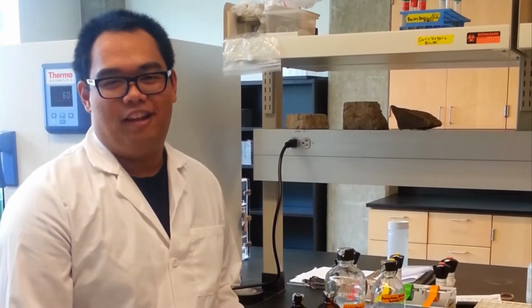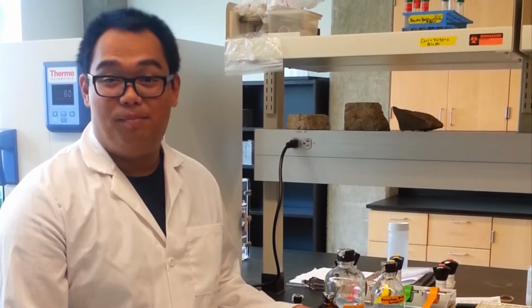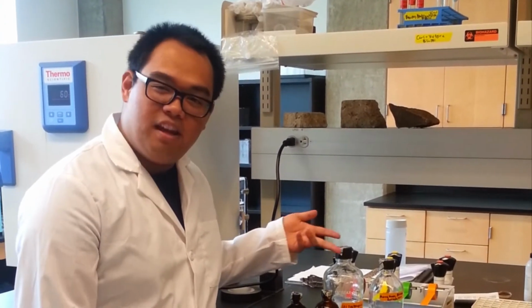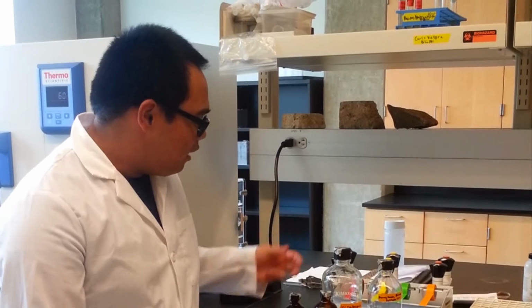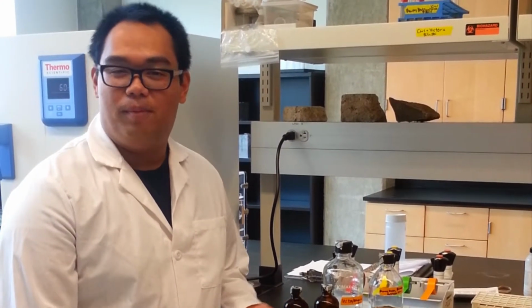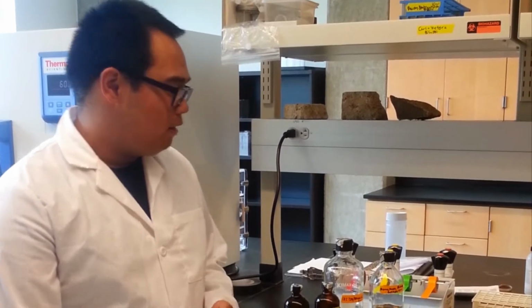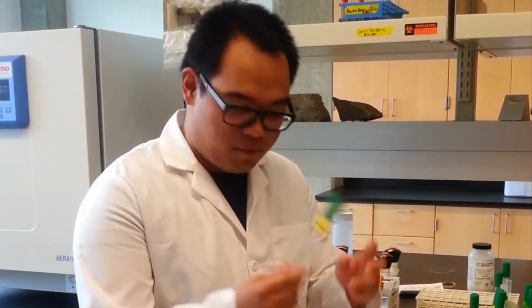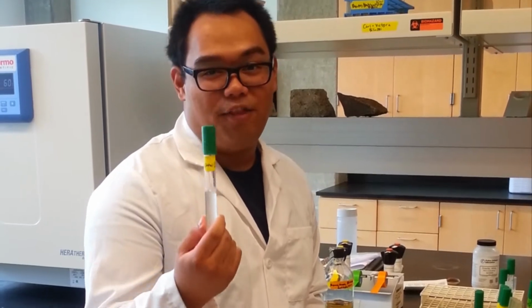So this is the ecology lab. The micro prep room is usually really busy, so I like to work up here as well. This is where we keep some of the media we use to grow our bacteria. Also where I keep the 2 concentrations of salicylic acid, which I expose the bacteria to as well. Just for a demonstration, this is what the tubes start out with, so it's really clear. But after about 24 hours or so, they end up really cloudy, which means we've got growth, and that's what we want.